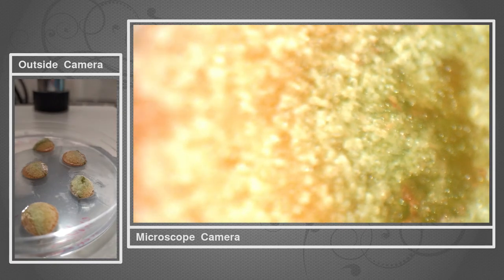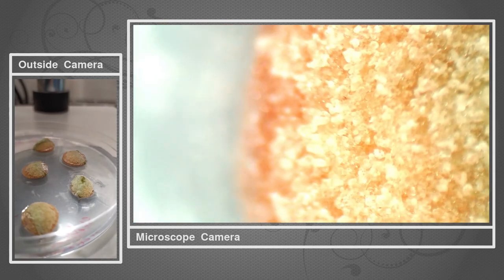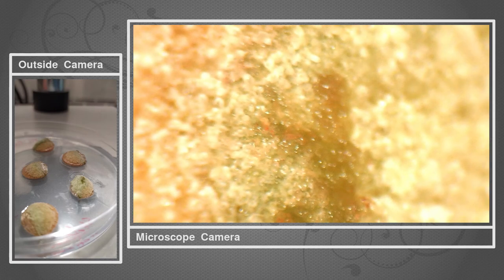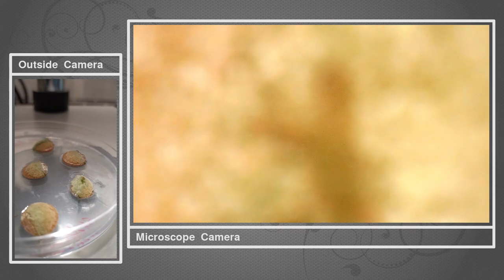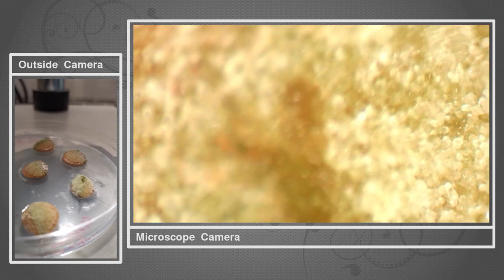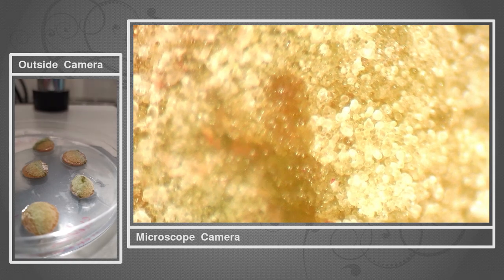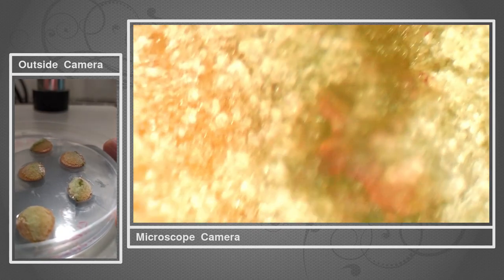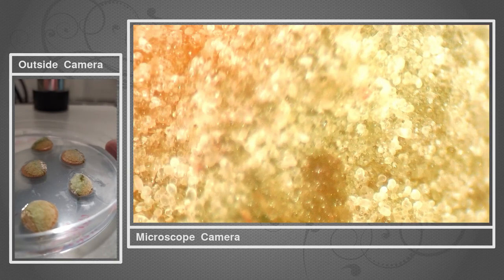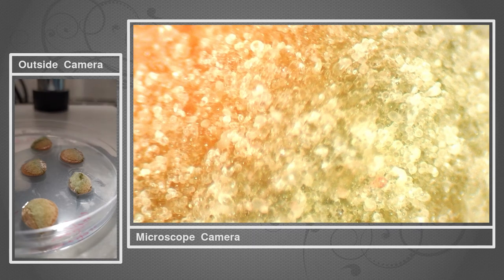Cells look fairly loose. Let me try to see if I can go to higher magnification — I may need to adjust things a little bit. I'm actually just lowering this whole head of the microscope so I can get better focus at higher magnifications. Again, you can see very clearly we have a bunch of cells on the surface of this callus. This started out as a disc of a carrot, and what you're seeing here after about four to five weeks is growth of these de-differentiated cells.